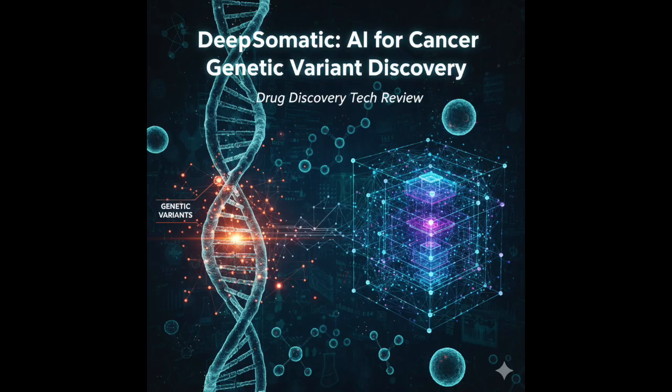So DeepSomatic is trying to pinpoint these specific culprits hiding in all that biological and technical noise. Precisely. It builds on DeepVariant, which was already very successful for germline variants. Right, we covered DeepVariant before. But DeepSomatic is heavily modified. It had to be, to handle the specific complexities of cancer genetics, the heterogeneity, the low frequencies, the artifacts. And the payoff if it works? Huge. If we can reliably find the exact somatic variants driving a specific patient's cancer, well, that tells doctors which targeted therapy might work. Precision oncology. Or it could point the way to completely new drugs. Absolutely. It accelerates that whole pipeline from diagnosis to drug development. It's a really critical piece of the puzzle.